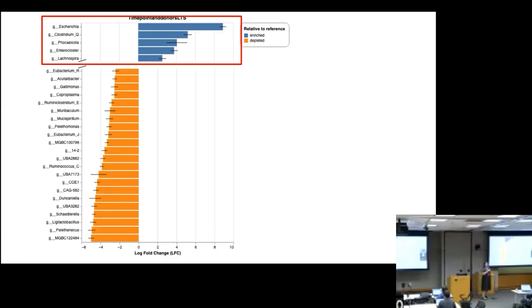I talked to someone who had a kind of interesting idea of basically barcoding their microbes in the gut microbiome so that they could specifically track that it was a donor microbe, because those were barcoded as the donor. But again, you could miss that if it just wasn't high enough abundance. So I guess it's just kind of crossing the fingers.